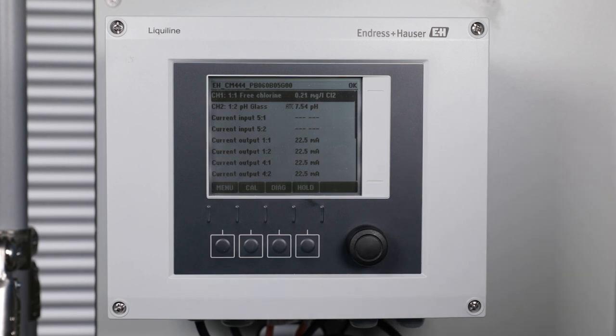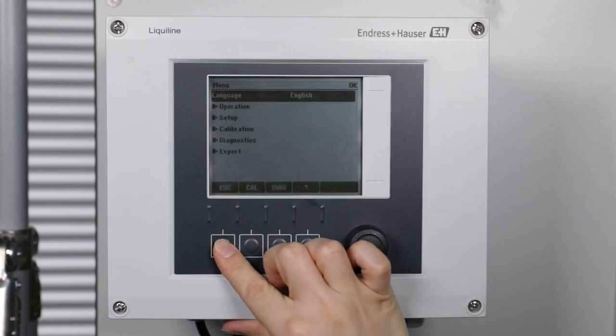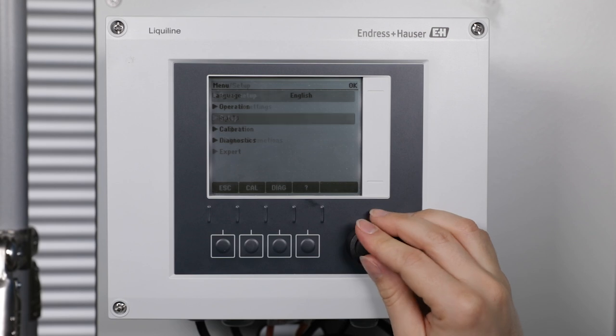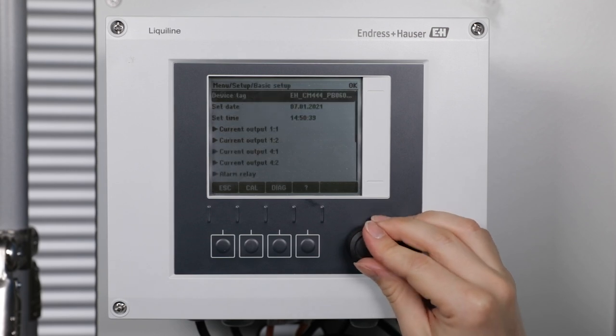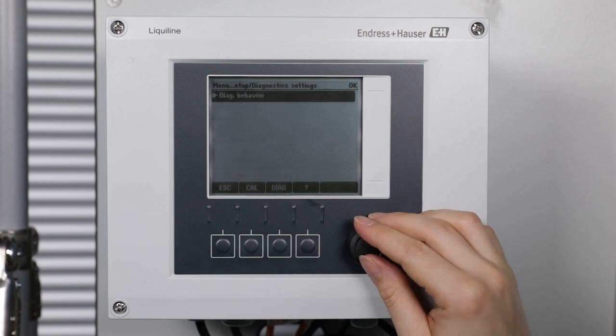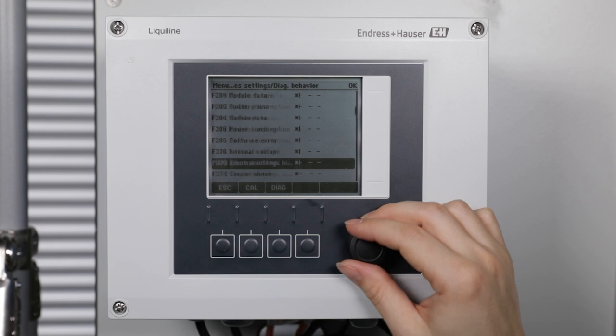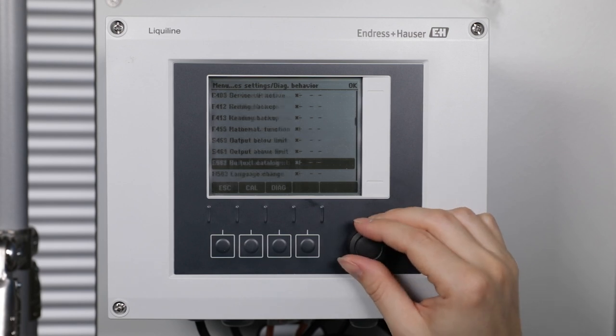To assign the flow switch for the status indication light, reconfigure the diagnostic message for the limit contactor S910 in the menu, setup, basic setup, diagnostic settings, diagnostic behavior, then down to S910 limit switches.